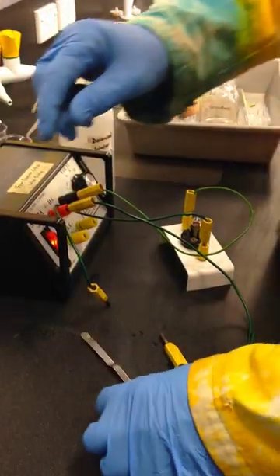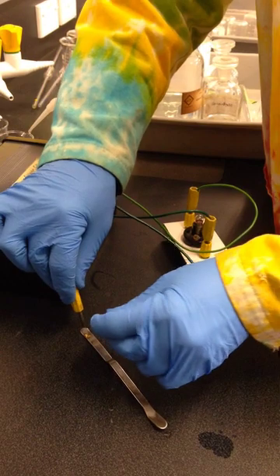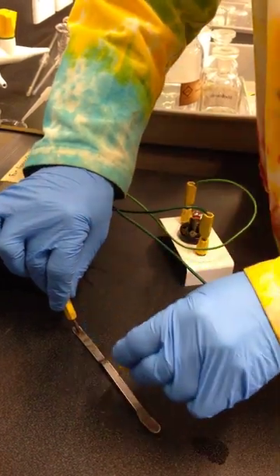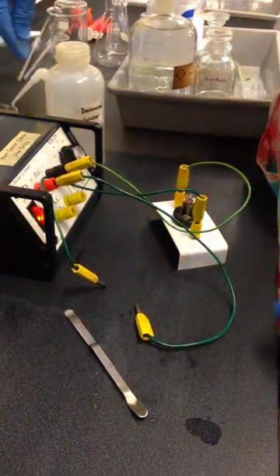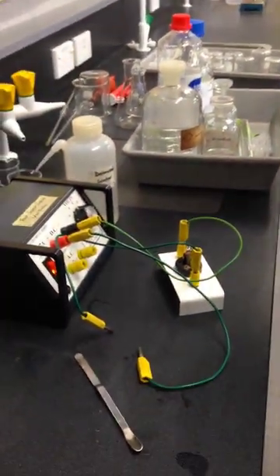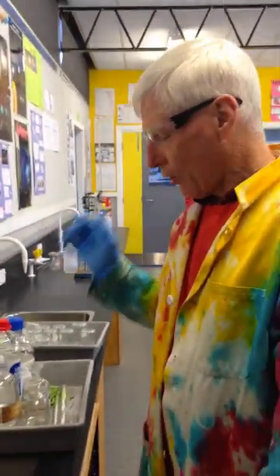Here's a metal spatula. I put that on the thing and you can see that the light bulb glows straight away. So, none of these molecular substances conducted electricity. The metal spatula did. If I put some salt into the water, I would get an electrical conductivity.